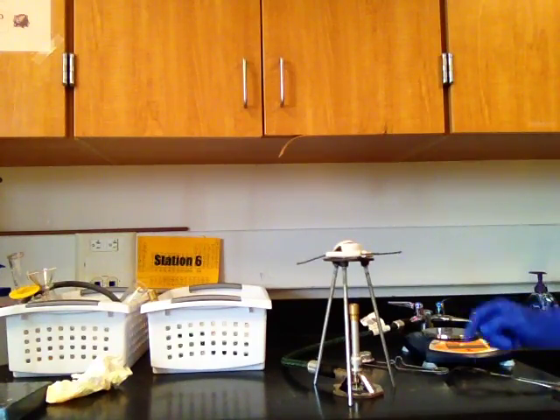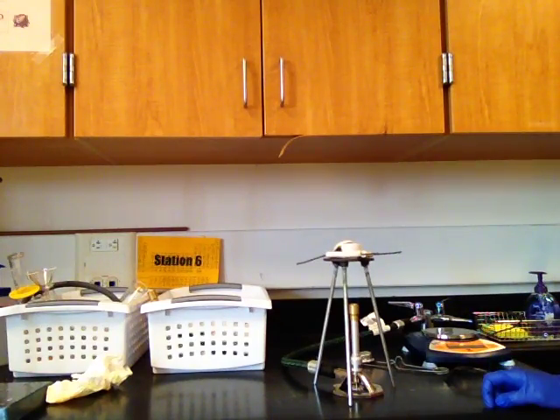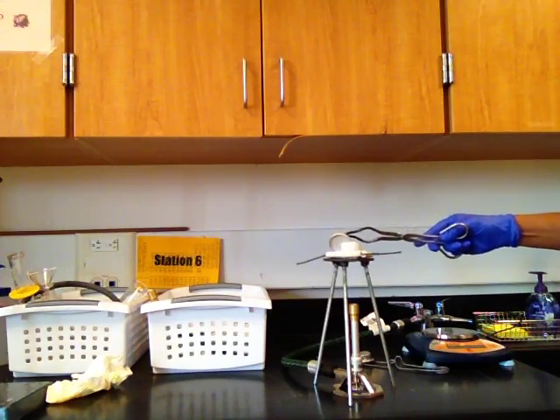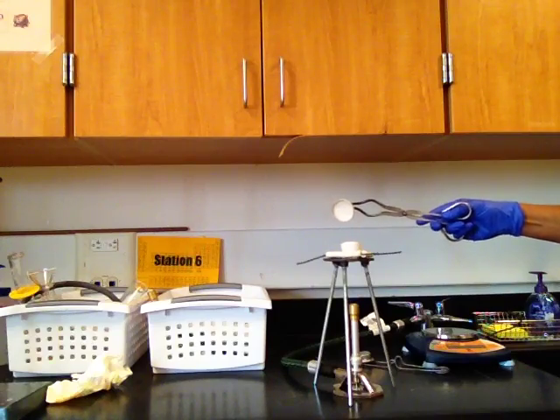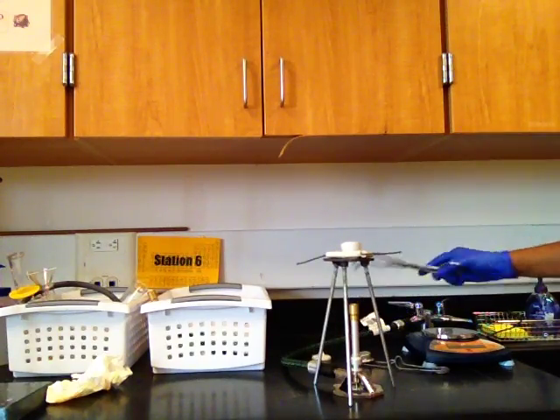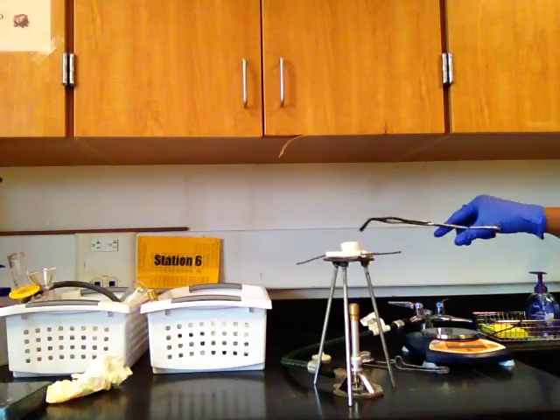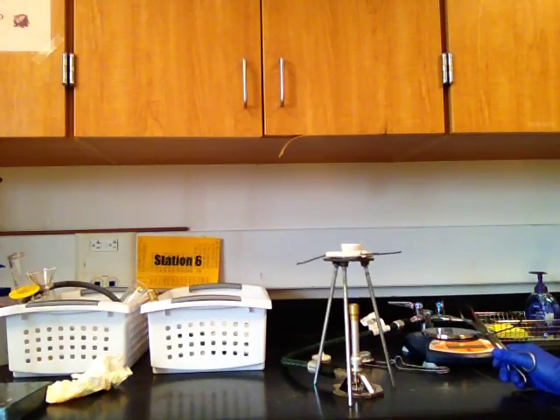The flame is clear. It is heating up the crucible really nicely, and you don't have to cover it for finding the formula of hydrate. So it is up to you if you want to use the lid or not. But if you're using the lid, then you must put the lid here as well to purify it. So now we're going to purify our crucible.